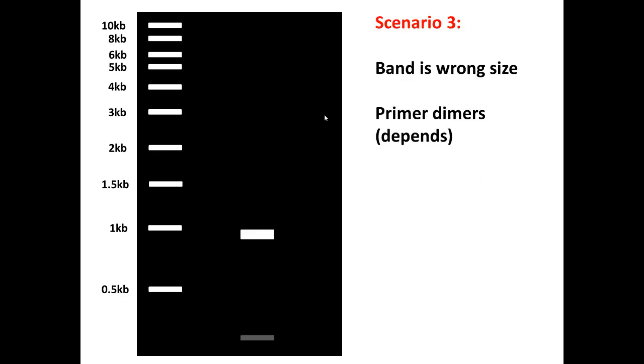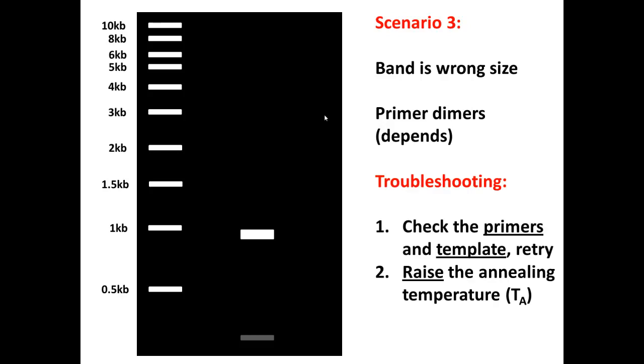Let's look at scenario three. You get a band, but it's the wrong size. So what do we do? First we get the usual primer dimers, but what do we do about this situation? Again, check the primers and templates and retry your experiment. This time you might want to try raising your annealing temperature, because this is definitely non-specific binding and raising it can help limit that for sure.